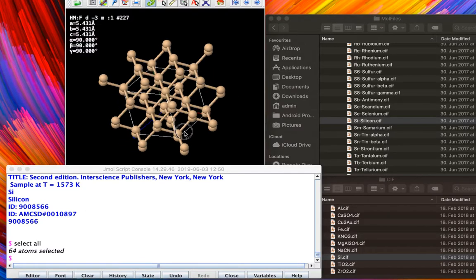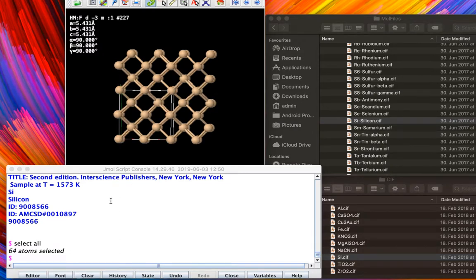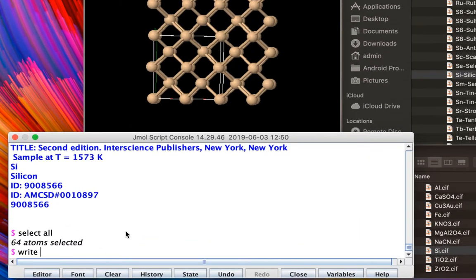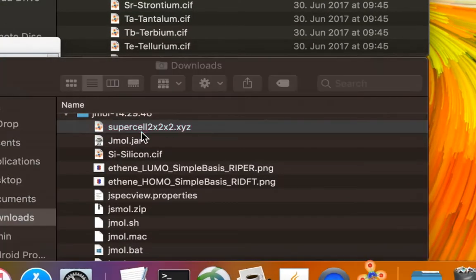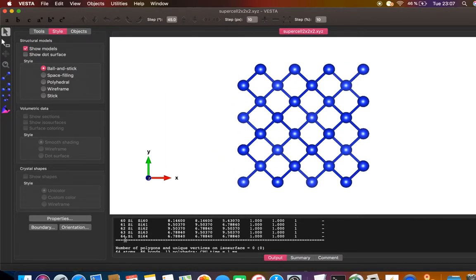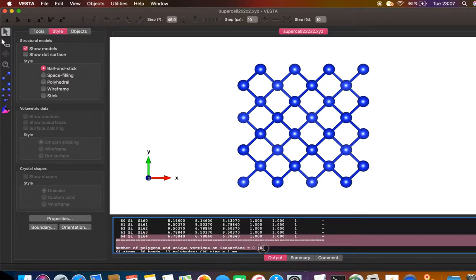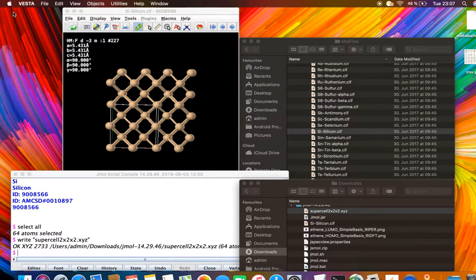Once you have generated the structure, you can save the atomic coordinates by giving the command `write` followed by a filename — for example, `supercell_2x2x2.xyz`. This saves the atomic coordinates as an XYZ file. Opening the file and visualizing it confirms there are 64 atoms for the 2×2×2 supercell. These coordinates can be used in Quantum ESPRESSO, VASP, or any other periodic code, along with twice the a, b, c lattice parameters for the crystallographic information.